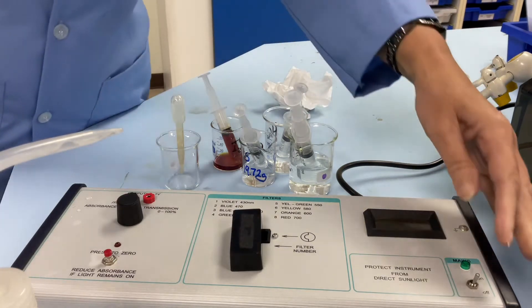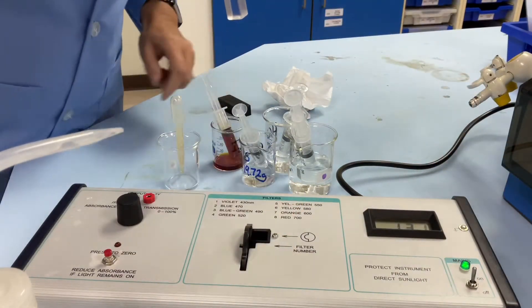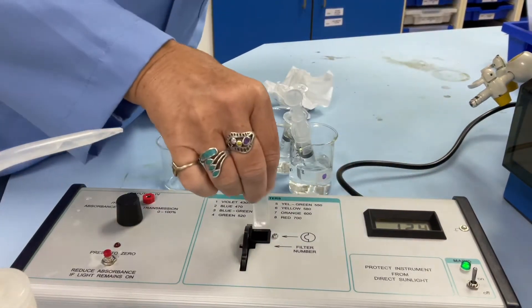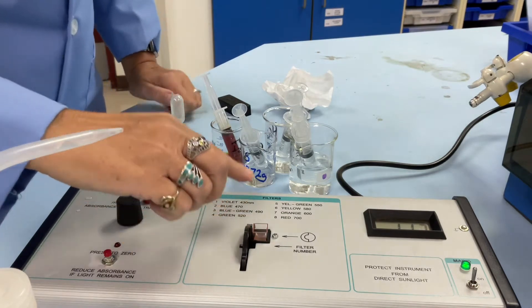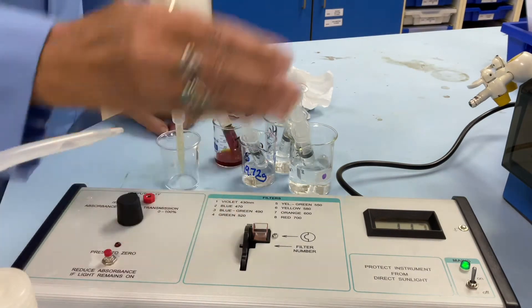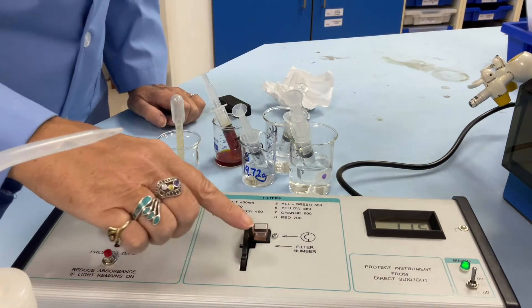We must make sure that we don't touch the clear side, which is the one that we're going to put into the colorimeter. The light shines this way, so we're going to pop it in here. And because we have iodine, it's an orange solution, the complementary color on the opposite side of the color wheel to that is blue. So we choose a blue filter.